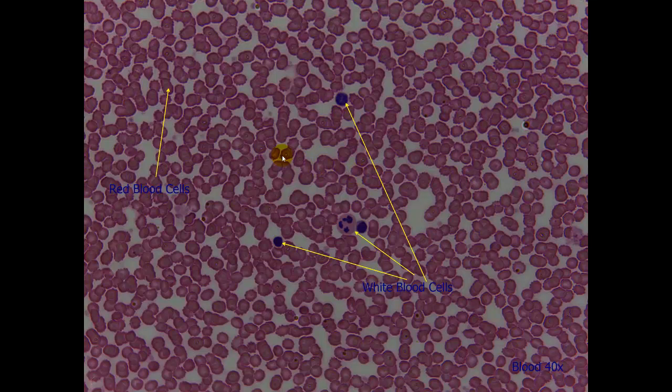Here is a slot on blood. The majority of cells that you see in blood are the red blood cells. Those are all the round red diskoid shaped cells. We also have white blood cells. As you can see here, they are generally larger and they will have dark stained nuclei. The type that is not shown here is the platelets. You often see the platelets as small purple granules or purplish granules in among the RBCs or the red blood cells.